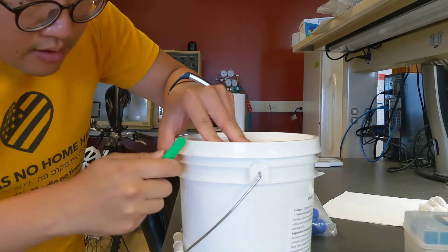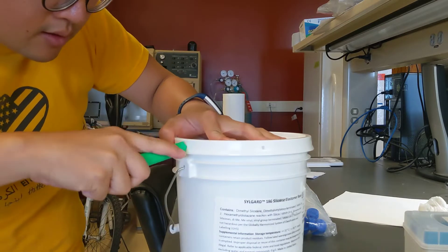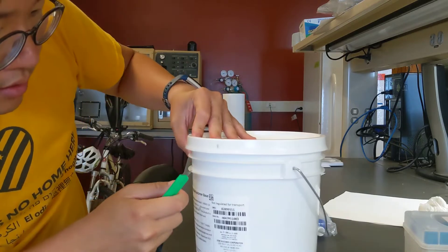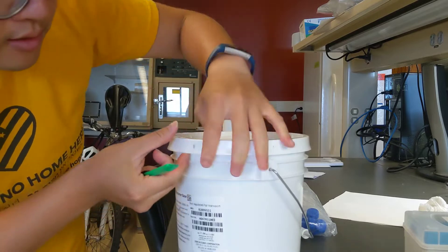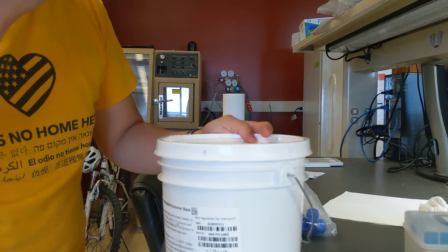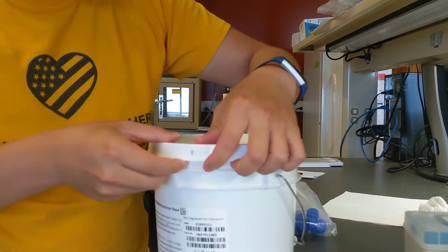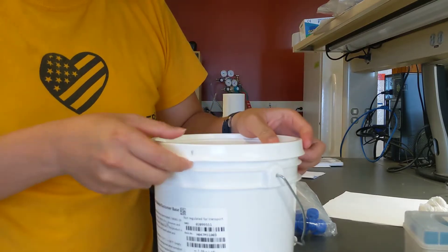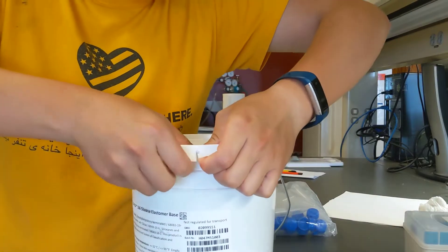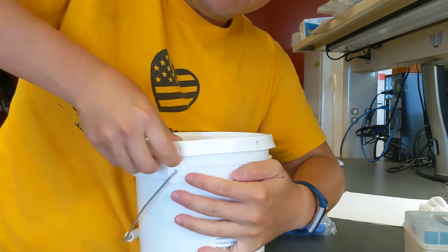Continue making cuts — one more, and probably the final one. You just make those cuts because it will provide you a better way to open it up. You can bend it this way, and then you will be able to easily open the cap like this.